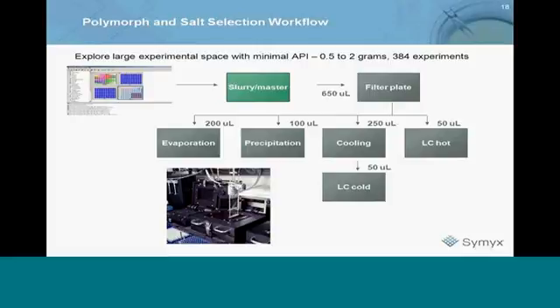It's a sealed filter plate, so if you're doing a variety of organic solutions that are hot, you don't see evaporation. Each one is filtered uniquely. The robot then cleans itself, it cleans the needles, uses the needles to reach down through, grab the filtrate, and pass the filtrate on to a series of additional plates.